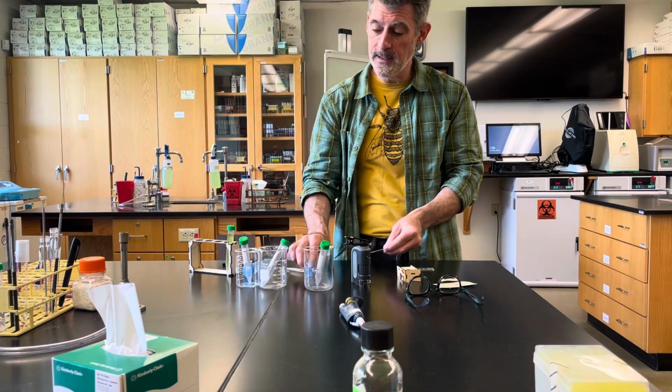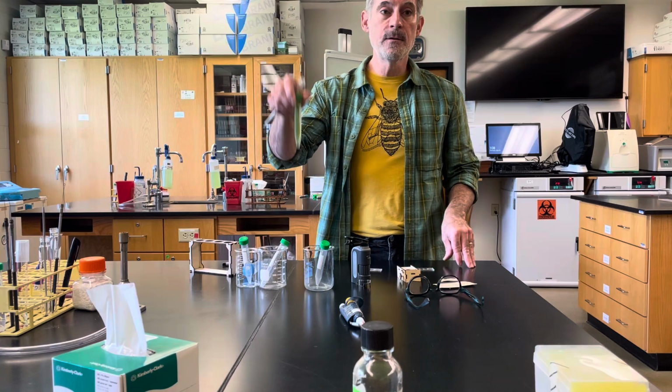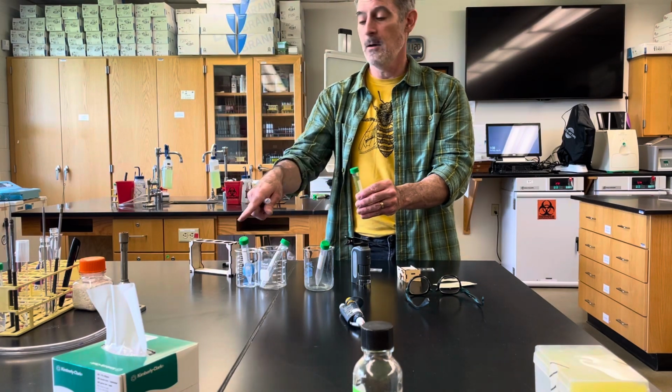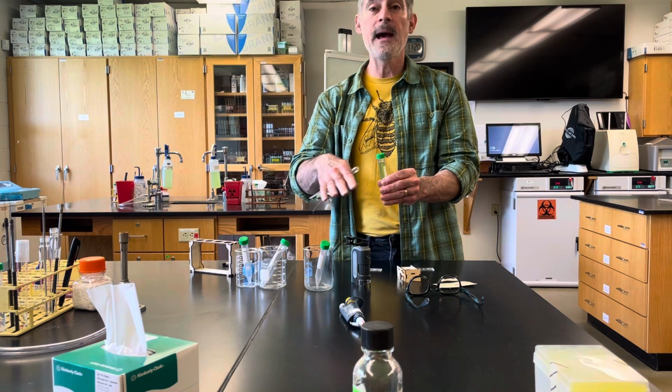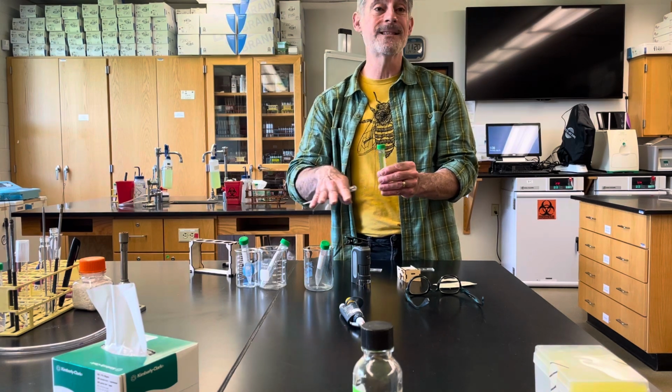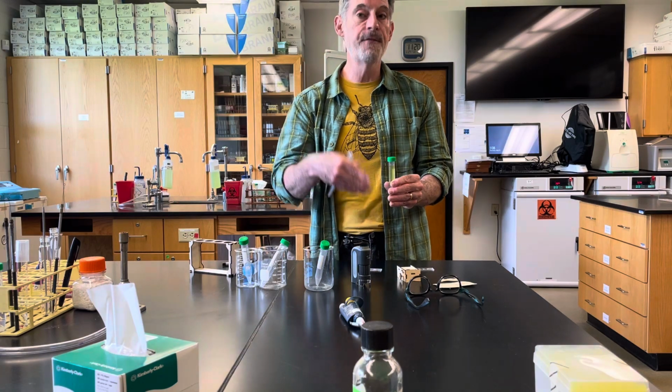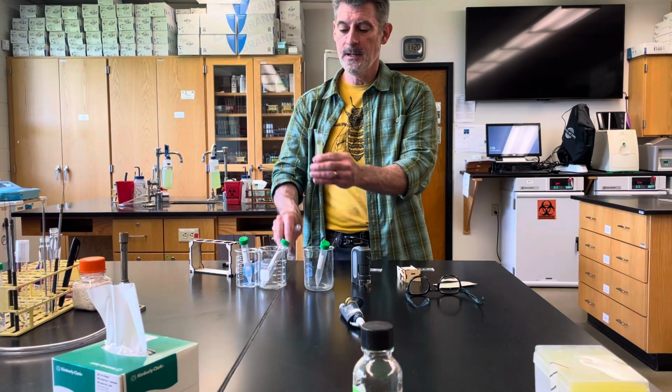So what you'll be doing is, after you do the dilution, so you'll take some of this, put it in the tube, all 3 tubes. Add your water to the tube, so now they're all exactly the same. That's when you want to count them, before you begin the experiment. Not from here.